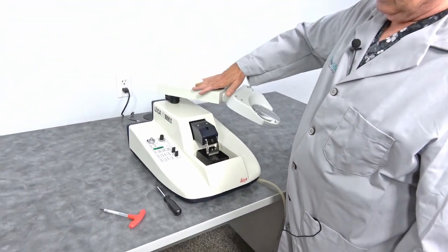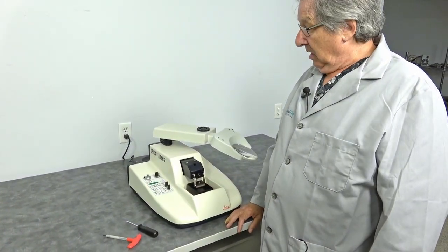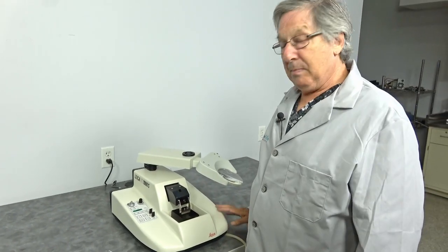In this particular case of what we're selling, it does include the tools to install the stage. And there you go. Thank you very much and stop back and see us again sometime.